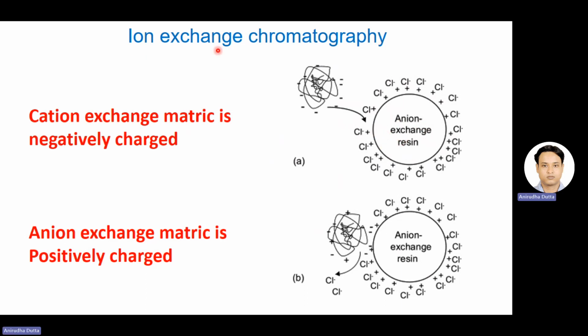That's why the process is called ion exchange chromatography. And in ion exchange chromatography, the proteins get separated based on their charge.